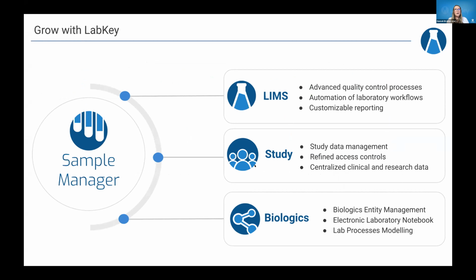So overall, we talked a lot about Sample Manager, and then I went into all these other integrations that we want to do. And we do have a vision for this product. Our goal really is to have Sample Manager be that starting point for labs. Everybody who is receiving stuff in the lab needs a tool like Sample Manager. If you've got a freezer, you probably need a tool like Sample Manager. And so we wanted to have this be the starting point for groups to start their data management journey and really then extend upon it.